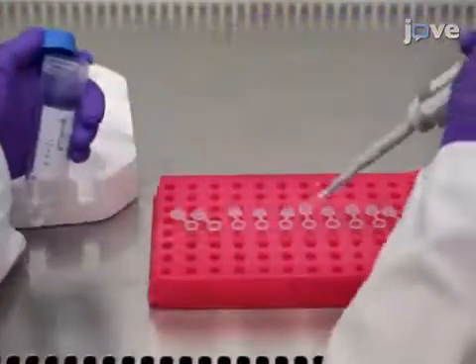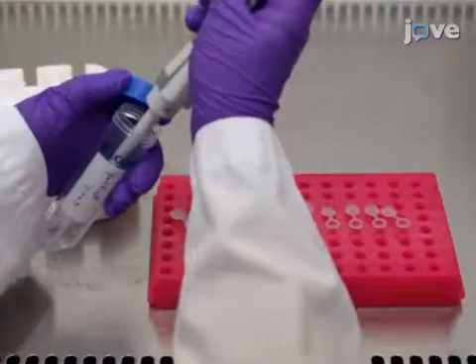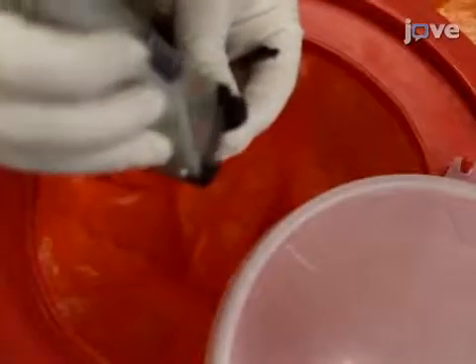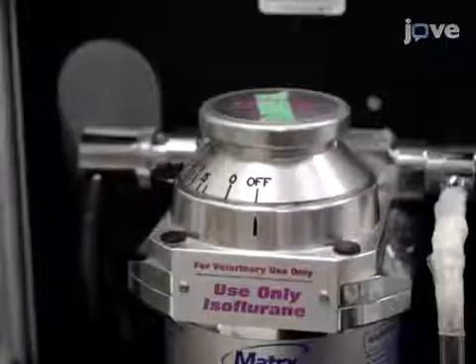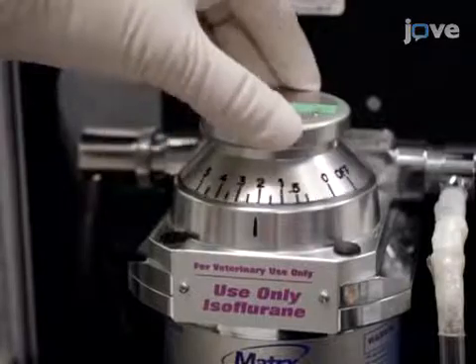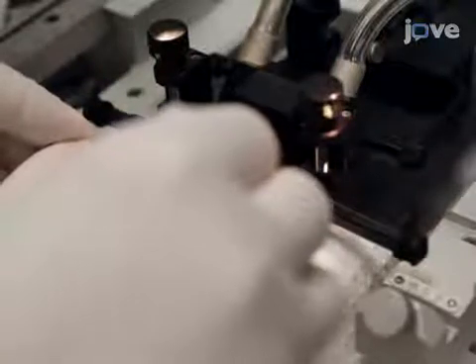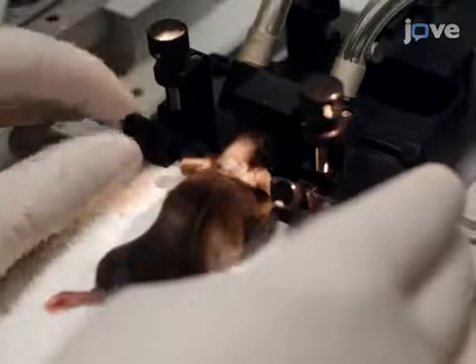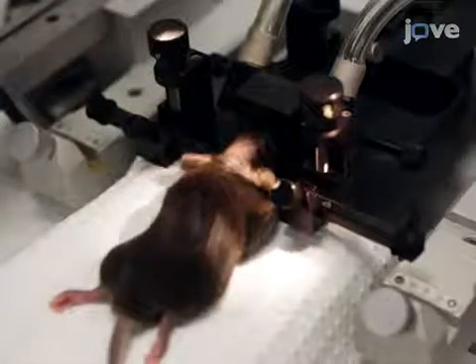The next day, aliquot the virus and freeze the aliquots at negative 80 degrees Celsius. To begin the injection procedure, shave the head of an anesthetized mouse in order to prepare for the injection site. Direct 4% isoflurane into the nose cone. Next, place the mouse in the stereotaxic instrument. Insert the bite bar into its mouth until its teeth drop into the slot before securing the ear bars. Ensure that the animal's body is on the heating pad and the nose is situated in the nose cone.